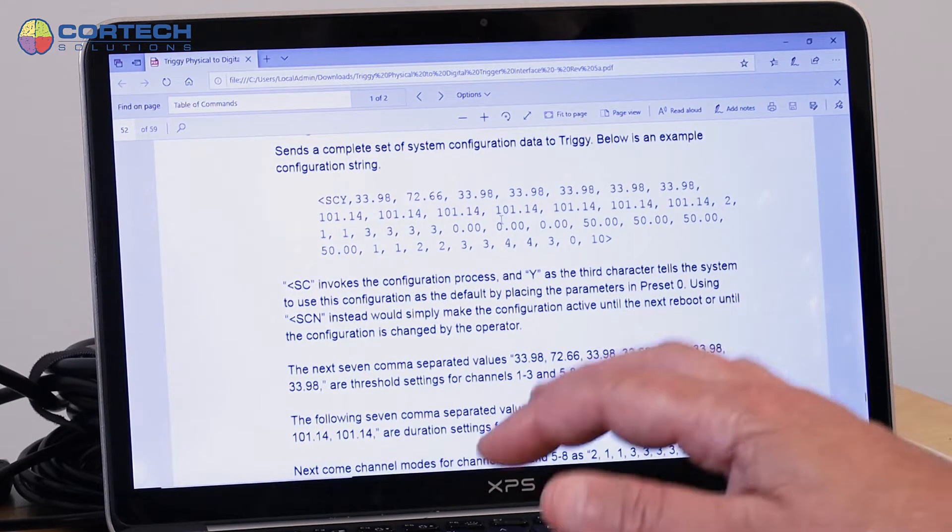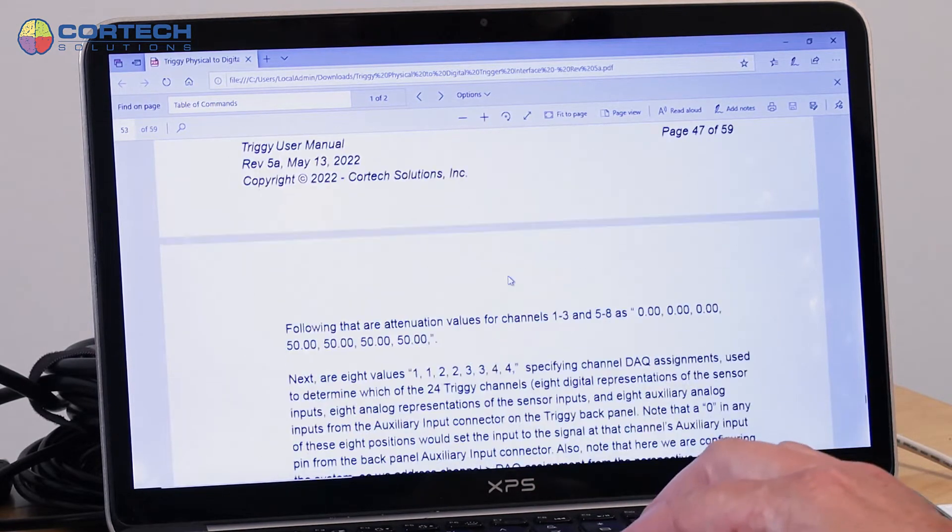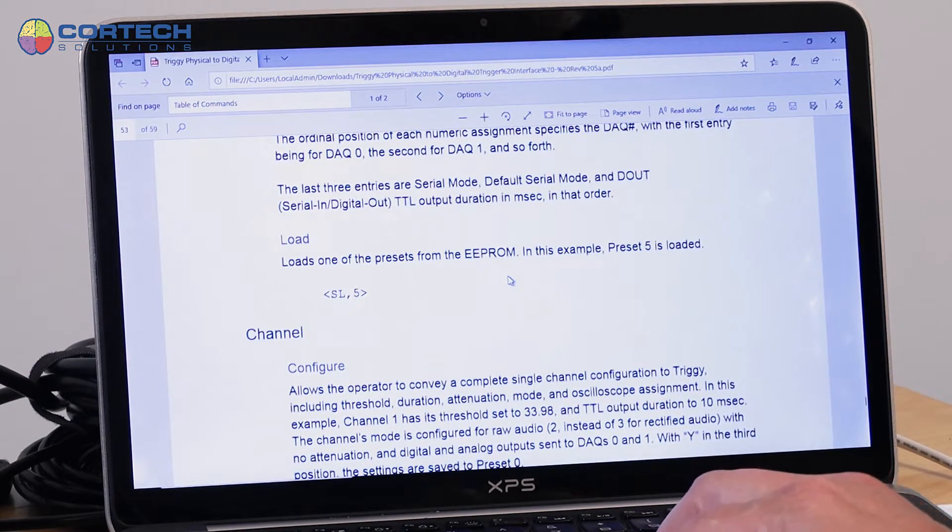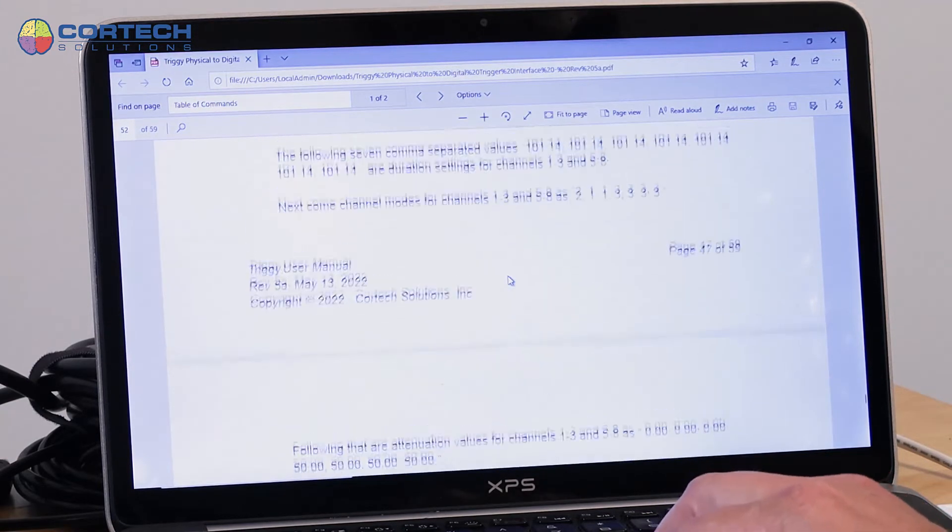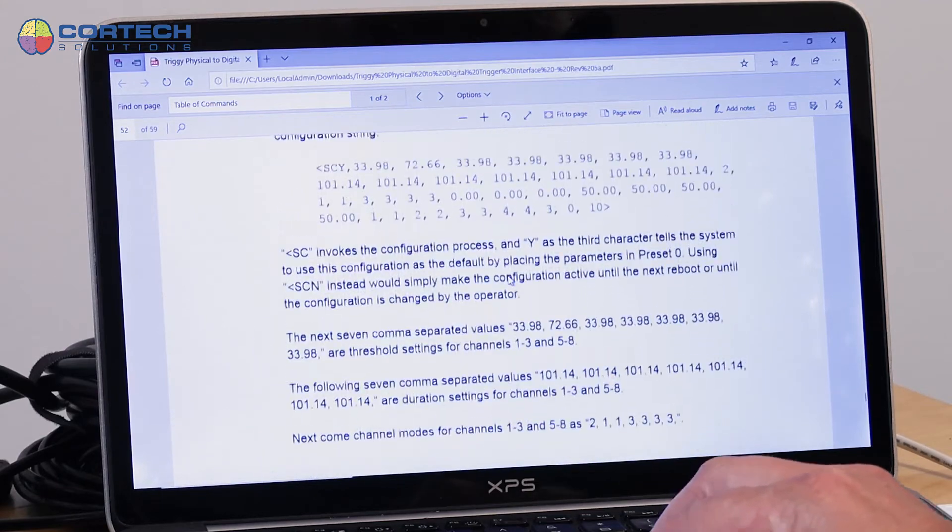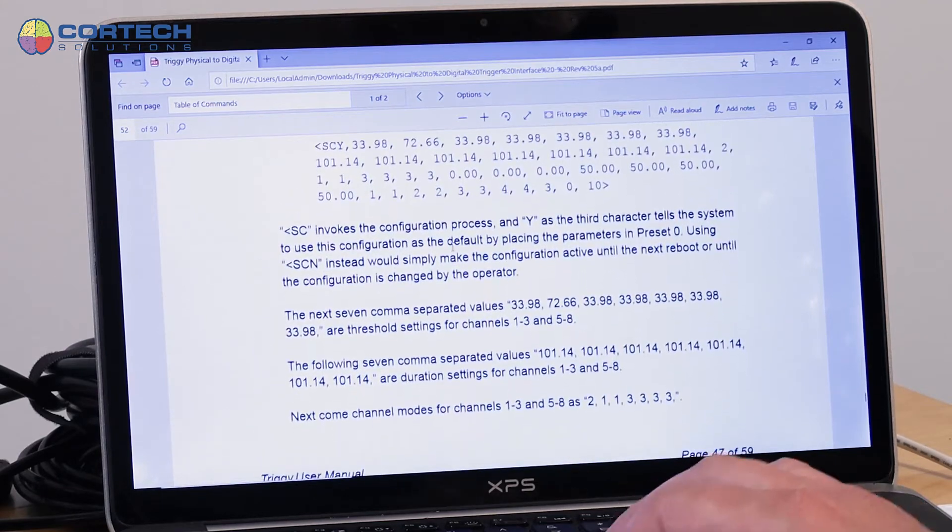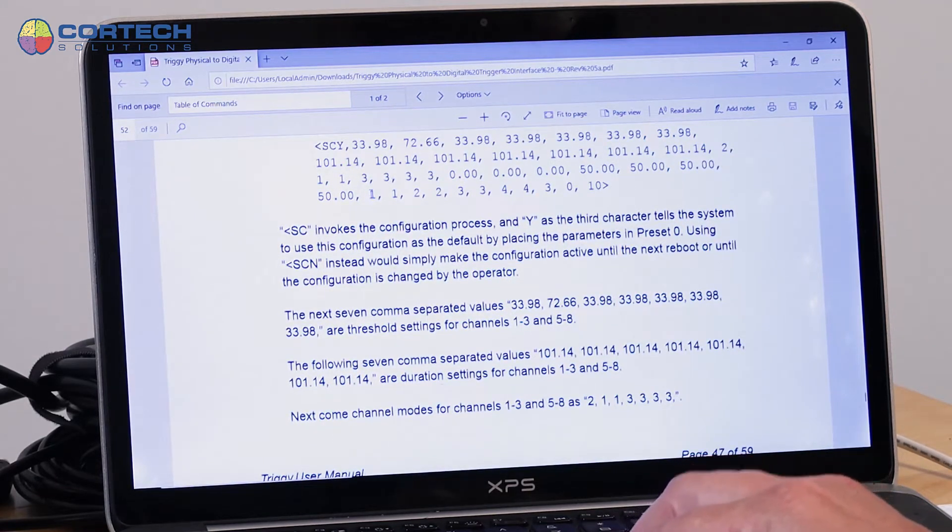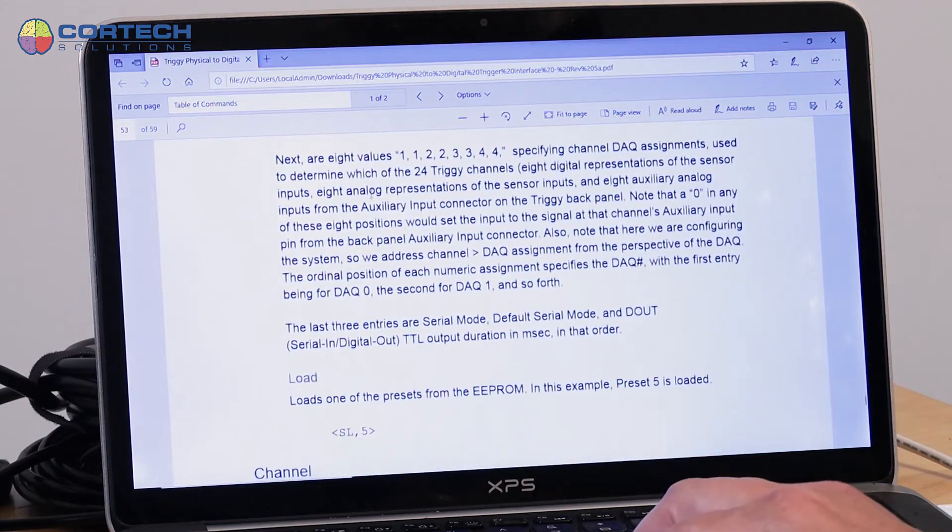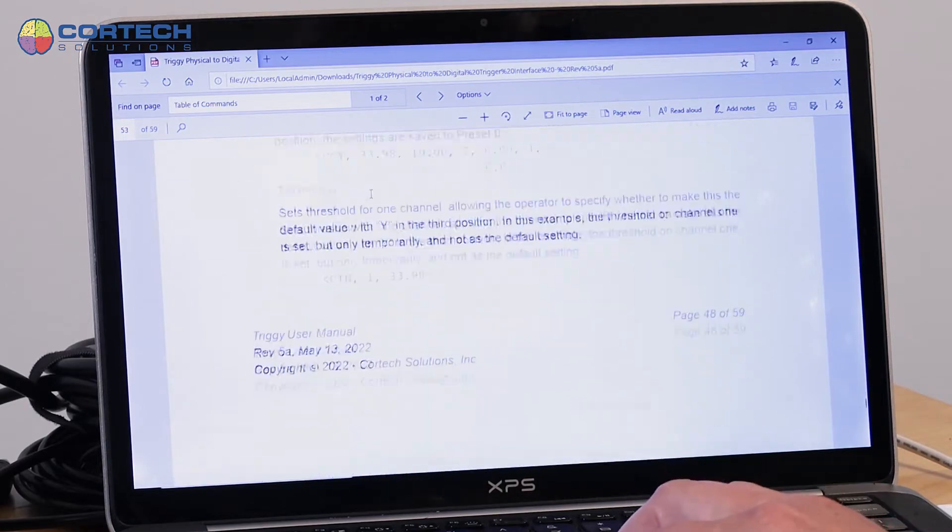So let's just take a simple example. Let's just take that example to tell, to ask the system to send us the current system configuration.